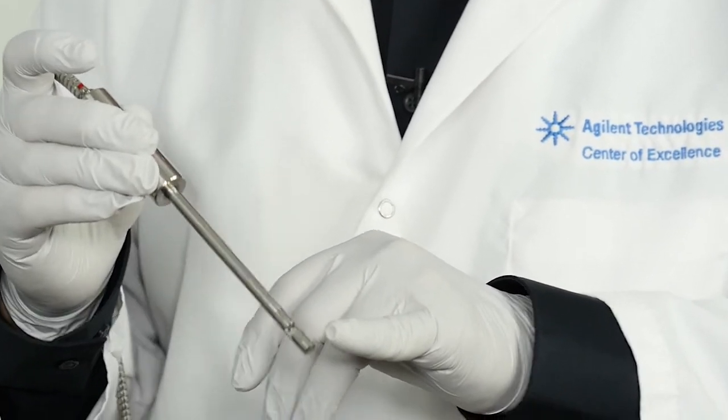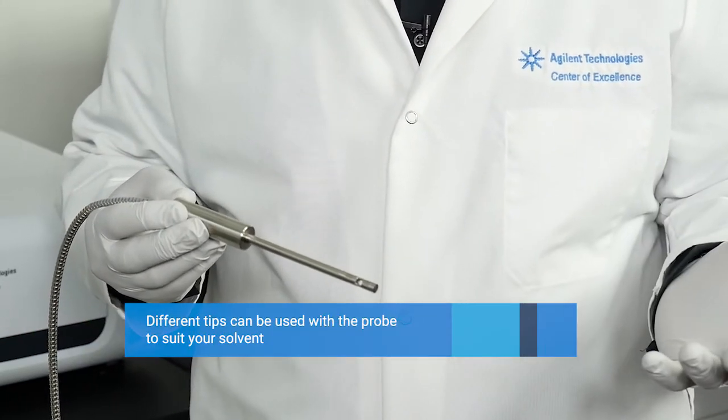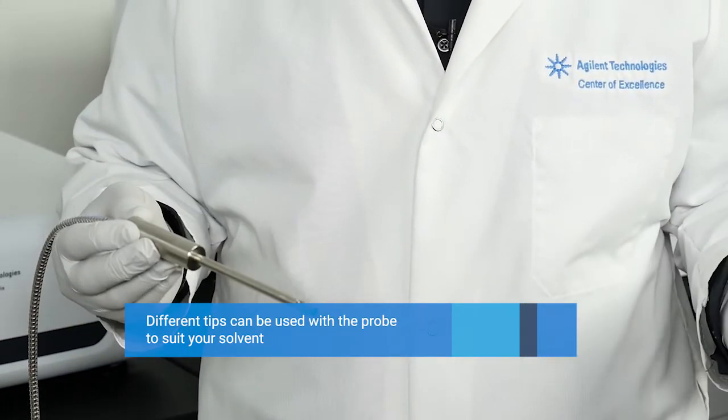Of course, that's important for quantitative analysis, and depending on the samples that you have, different tips can be added to be compatible with whatever solvent system you're using.